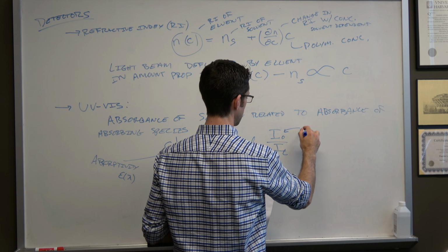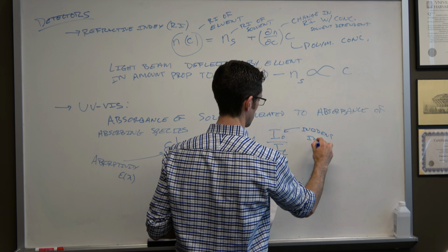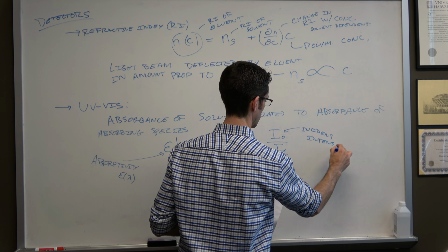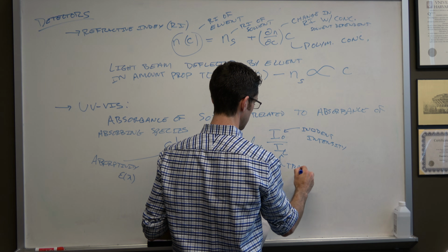I naught is the incident intensity. I T is the transmitted intensity.